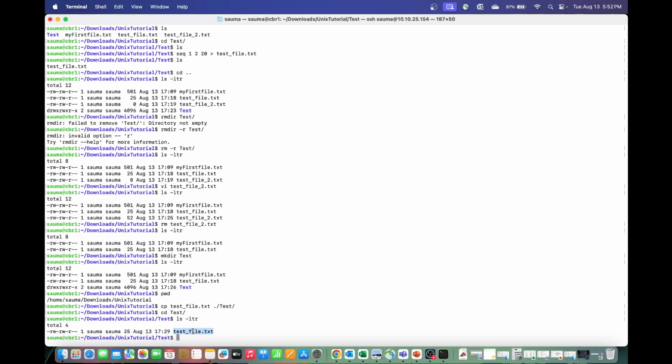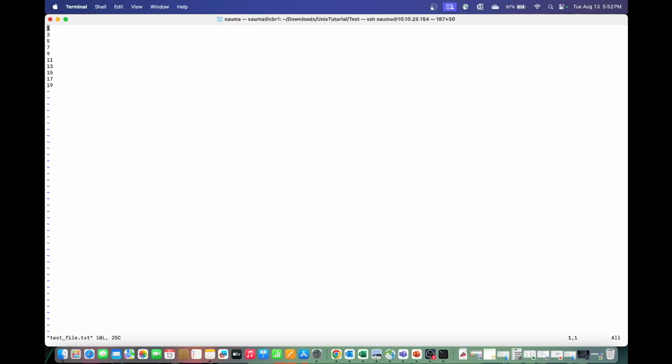See, the file has been created. Do ignore the timestamps because I think my lab computer is a little bit iffy in terms of the time. In yours it will be the same time that you're doing it. But anyway, this is the file that I have already copied here. Now let me check the file. It's the same file that was there. I have copied it here.